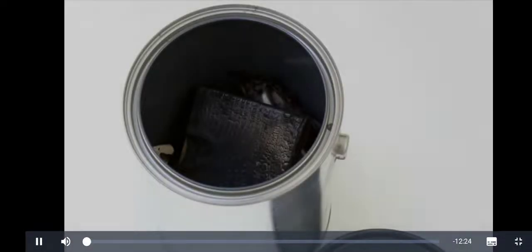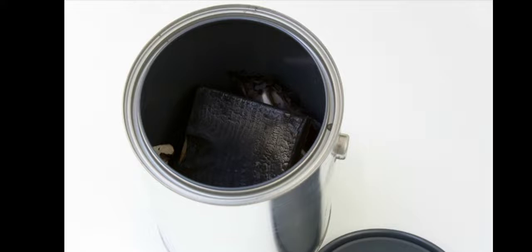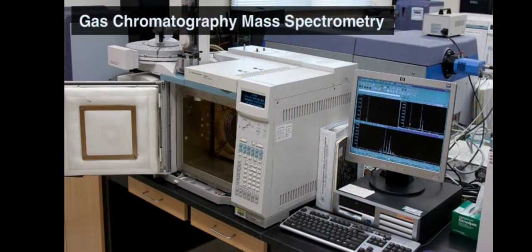One of the most common types of evidence encountered in an arson investigation is fire debris examined for the presence of ignitable liquids. Fire debris testing can determine if an ignitable liquid or its residue is present in the sample, and if it is, testing may be able to further classify the ignitable liquid or residue that is present. This examination is conducted using gas chromatography mass spectrometry.